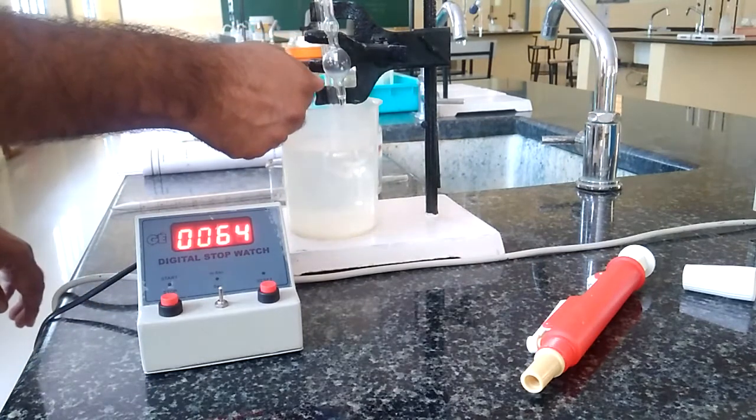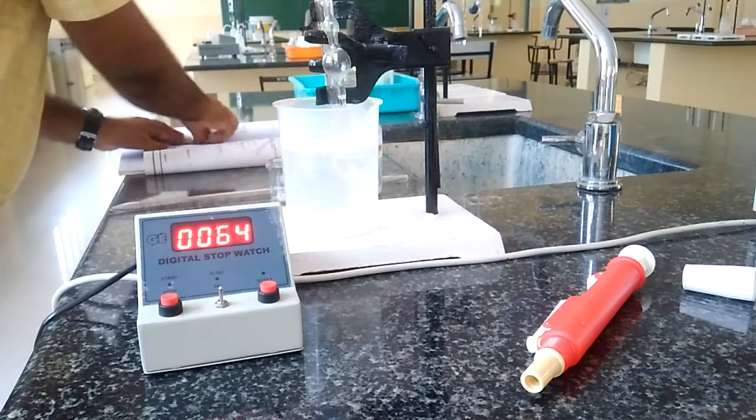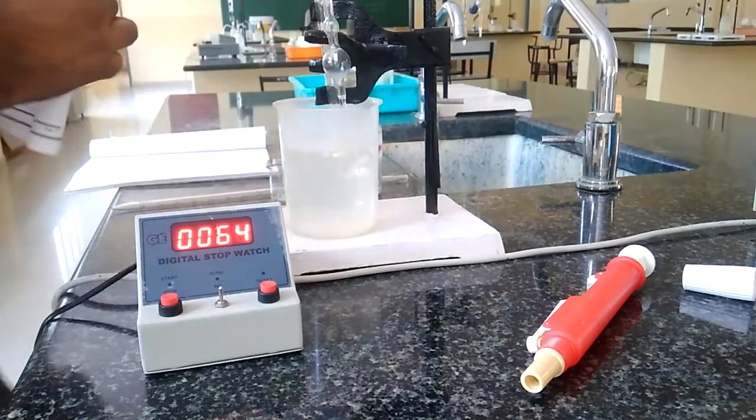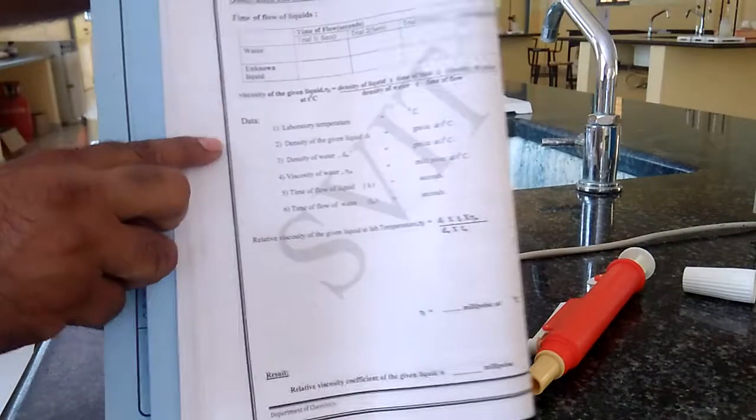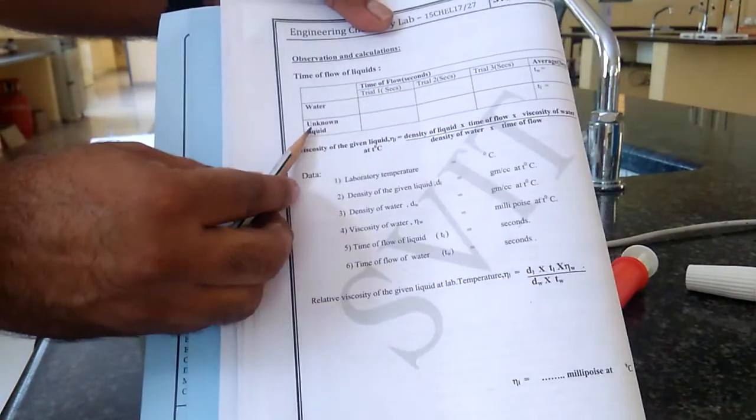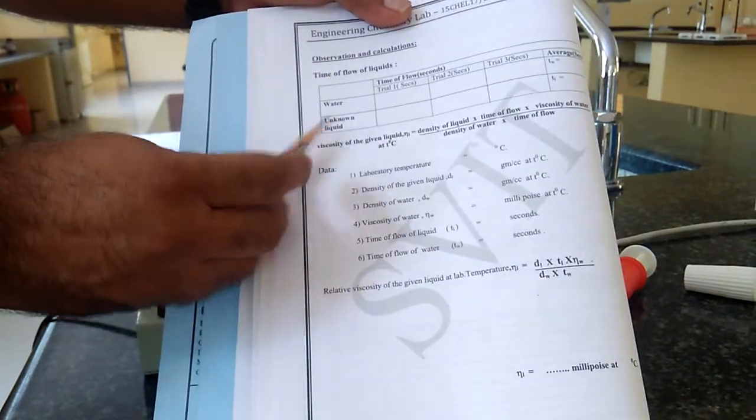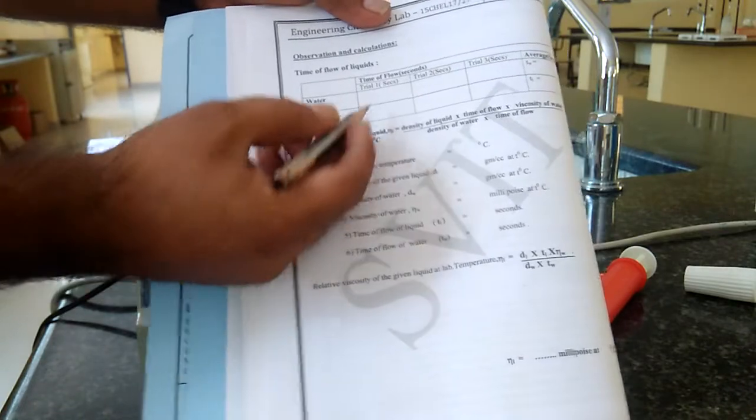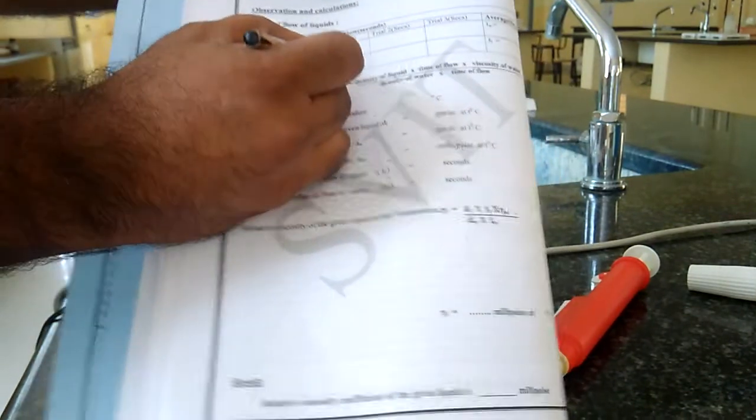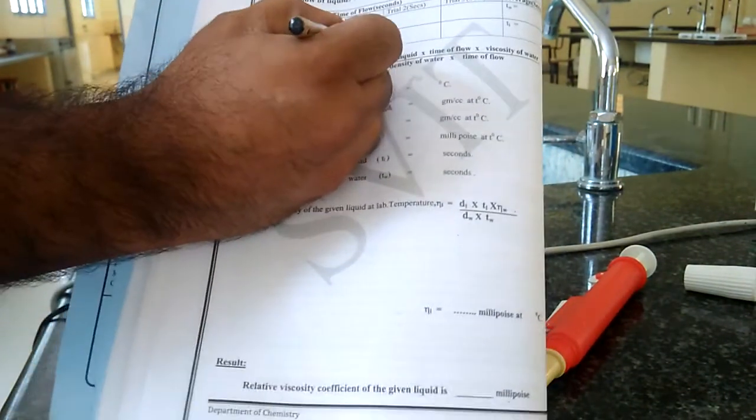This we have to record in the tabular column. This is the tabular column for the experiment. For the viscosity of our unknown liquid, first trial, it took around 64 seconds.